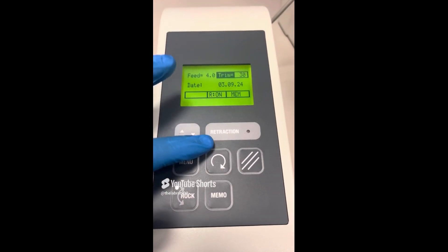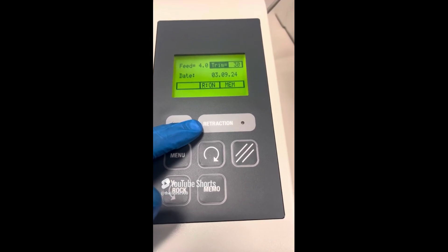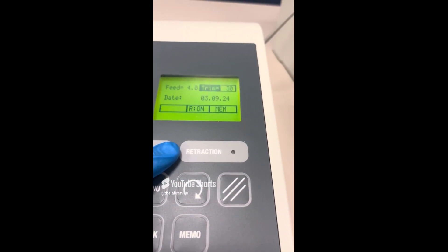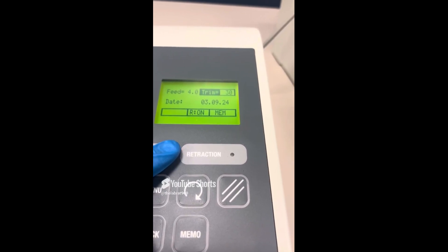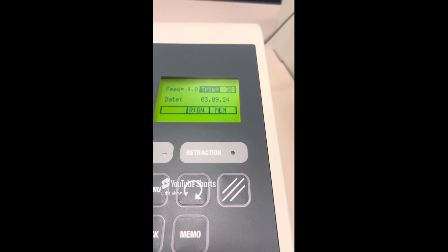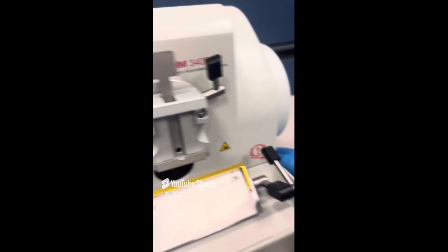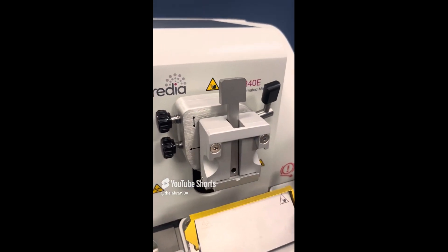You'll also see the retraction button. The cutting movements of the microtome are generated by turning that handwheel, which is moved clockwise. The specimen moves down and is moved back up when the handwheel continues to turn. You can see how it's moving down and then moving back up.